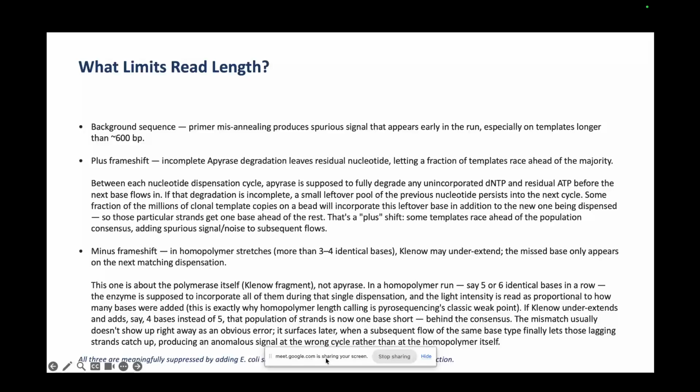Here, the issue was, if you go beyond a certain limit, say for example 700, 750 base pairs, the resolution of differentiation between 751 and 750 will be very low because you're going to do it in a gel electrophoresis. Remember, you have the DNA fragments, you run them through a gel electrophoresis, and based on the length, they will stack up, right? And based on the stacking up, you can get the full sequence. But the issue is that if you increase the read length, it is very hard to discriminate between two reads of very close lengths, right?